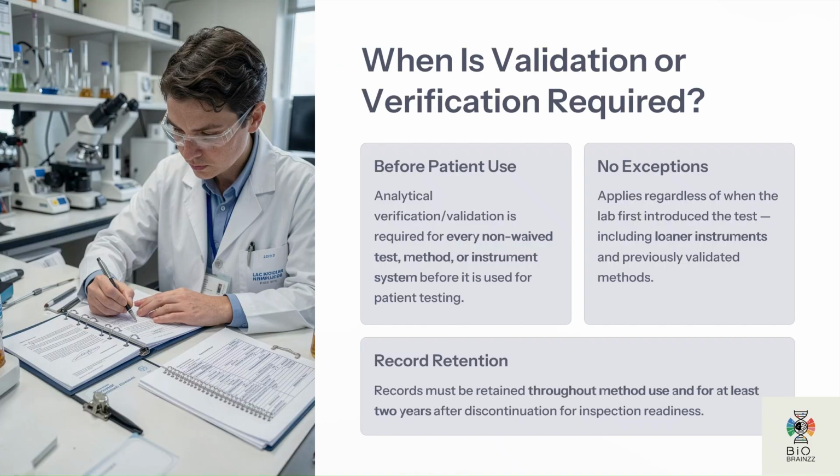Validation or verification should be completed before any method, test, or instrument system is used for patient testing or routine laboratory work. This requirement applies to new analytical methods, new instruments, modified procedures, laboratory developed tests, and transferred methods. There are no exceptions.